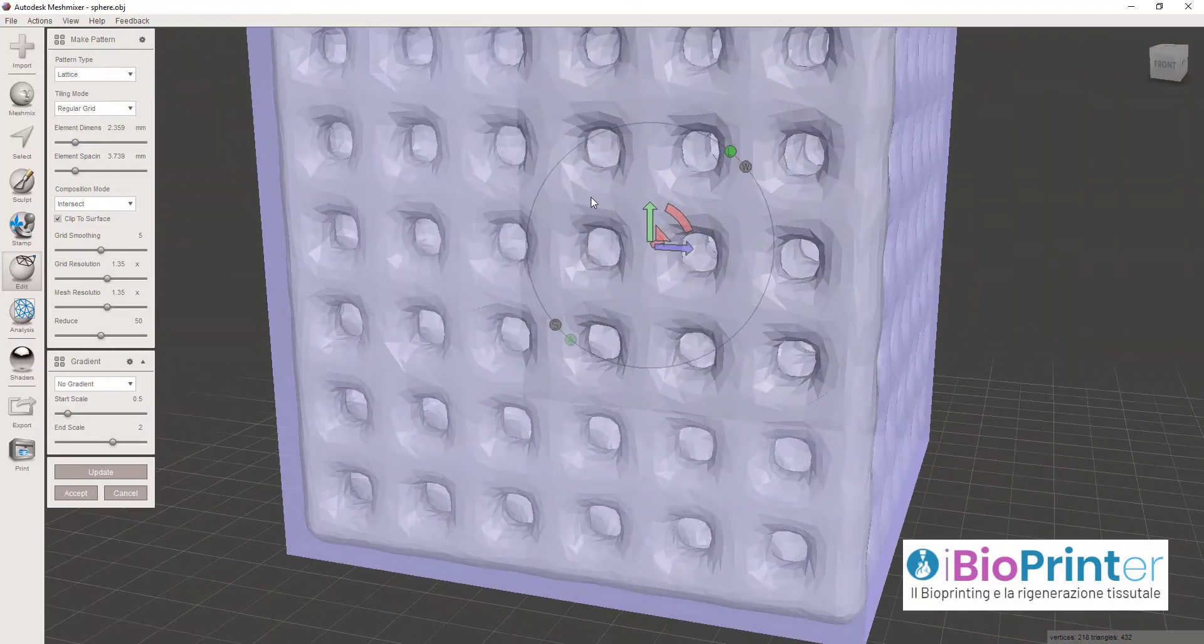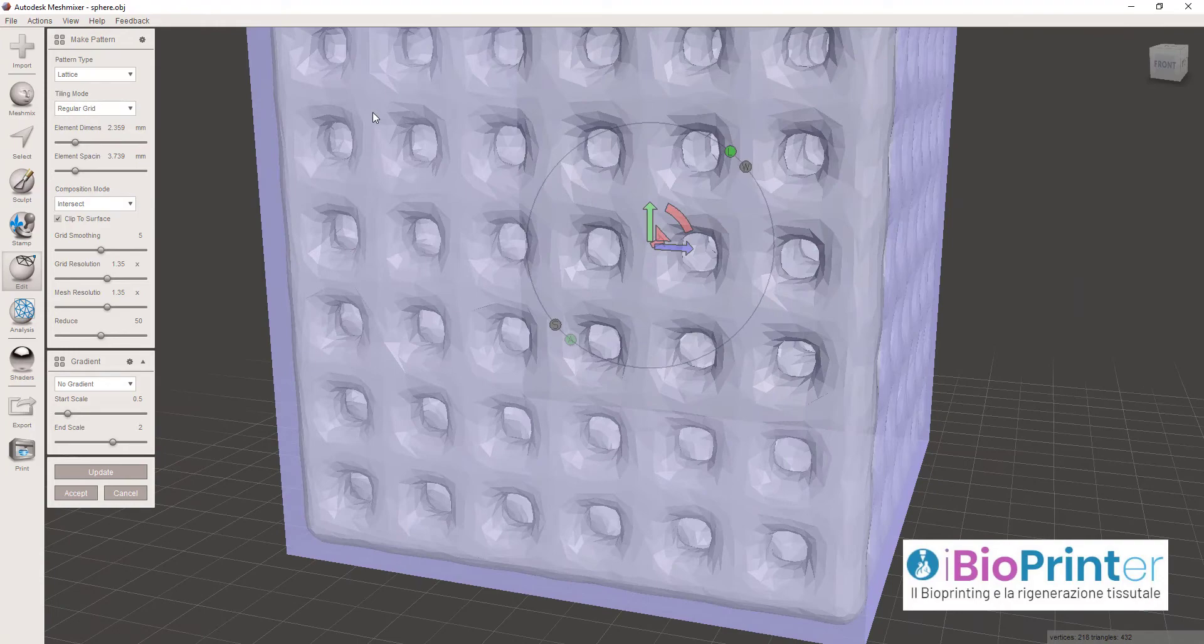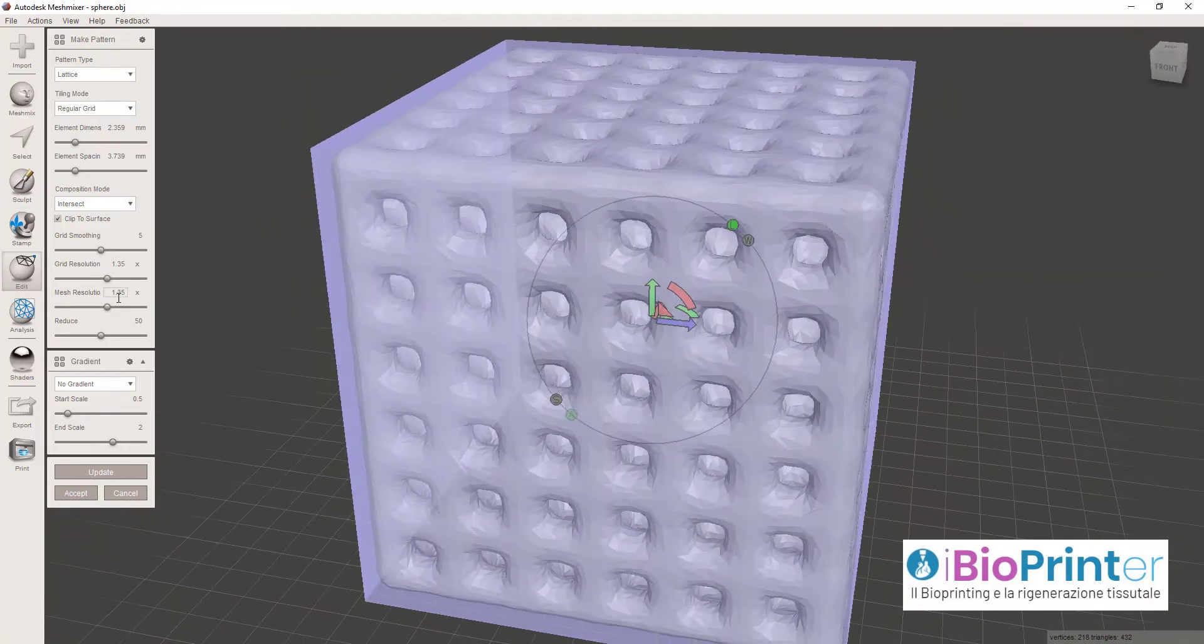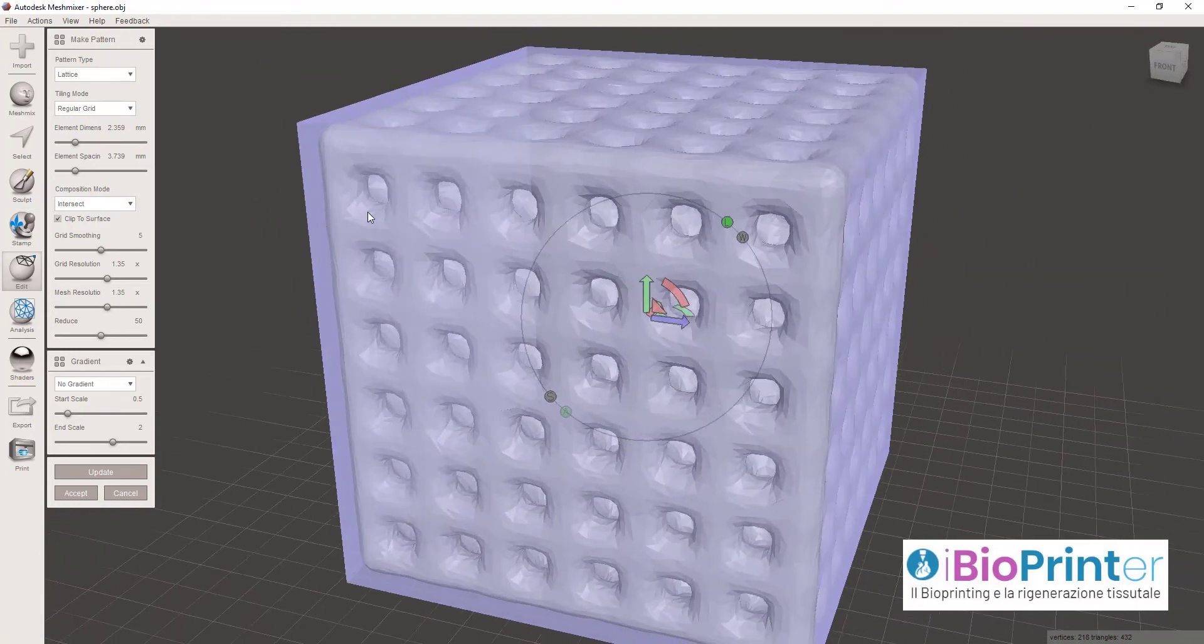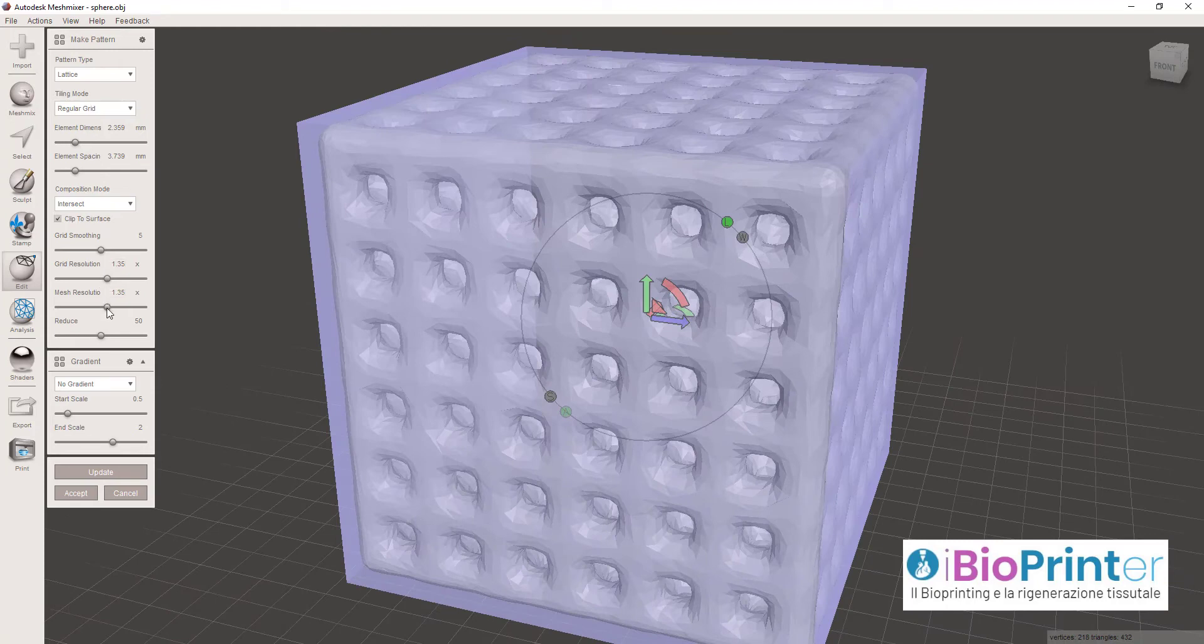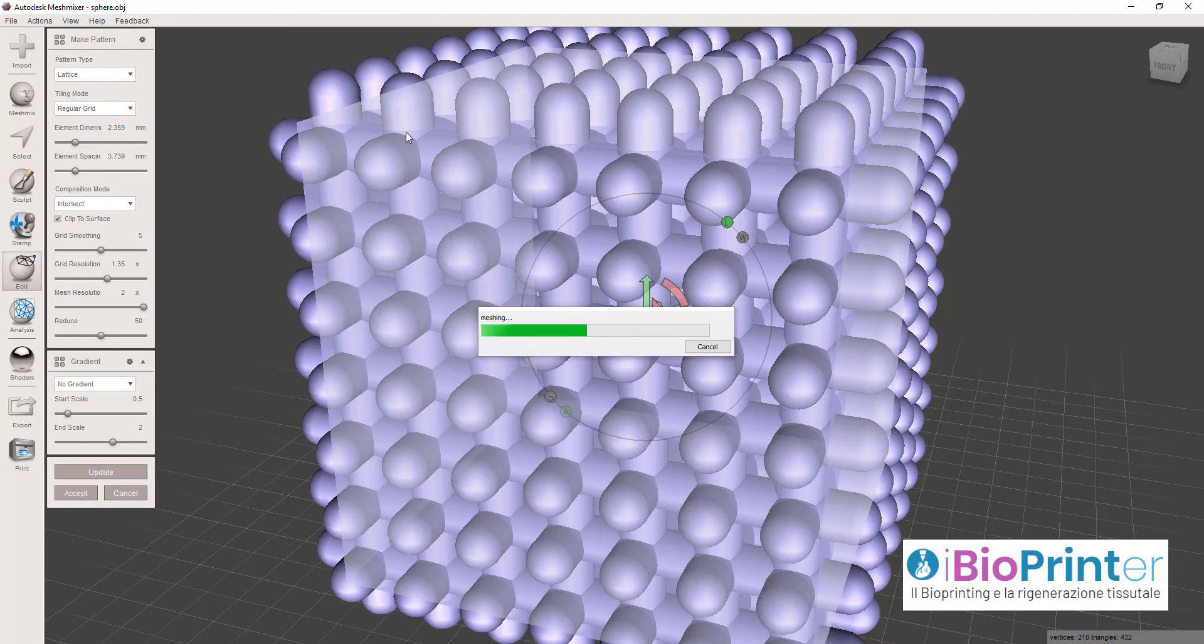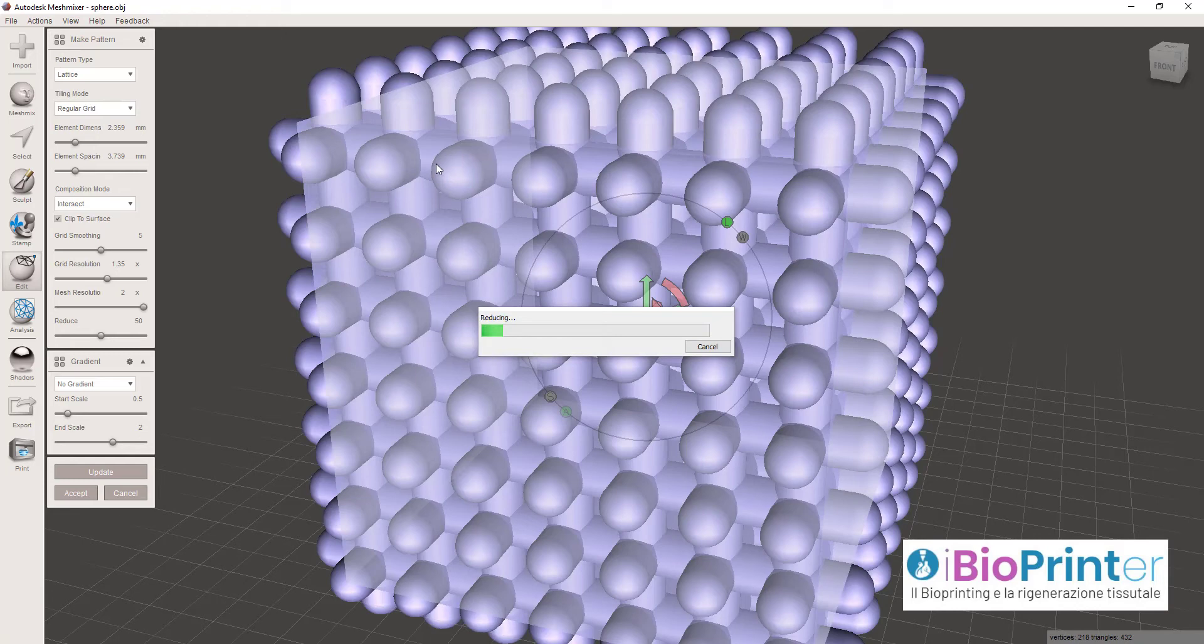Come vedete la struttura ha una serie di sfaccettature che la rendono poco precisa, ma queste possono essere migliorate cliccando su Mesh Resolution. Portando Mesh Resolution a valori massimi, vedrete che queste sfaccettature diminuiscono in maniera importante.